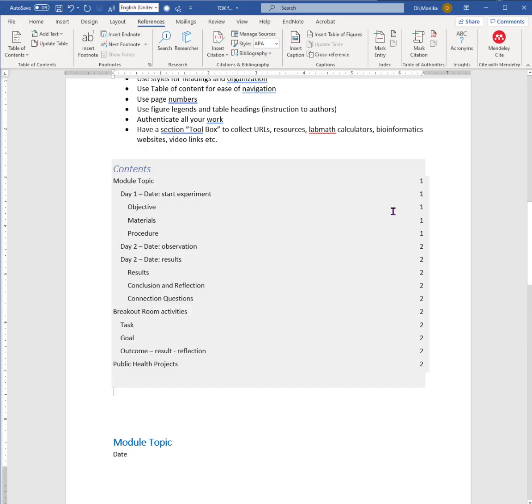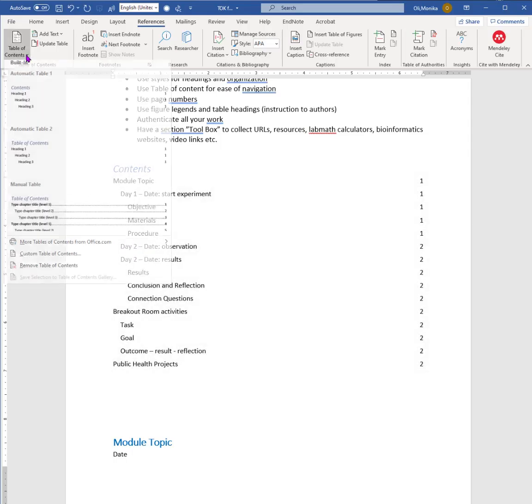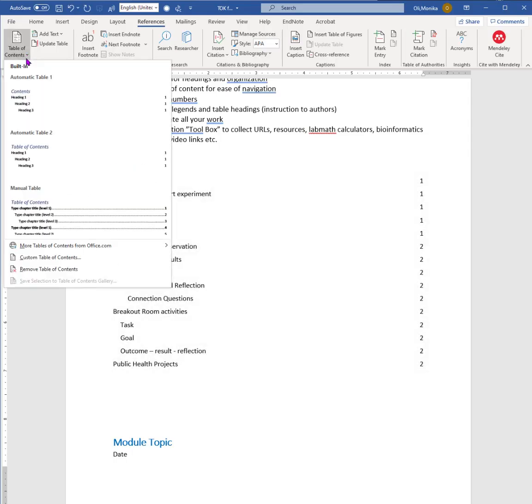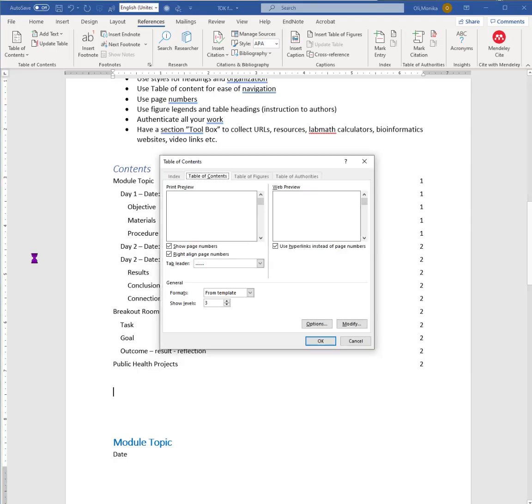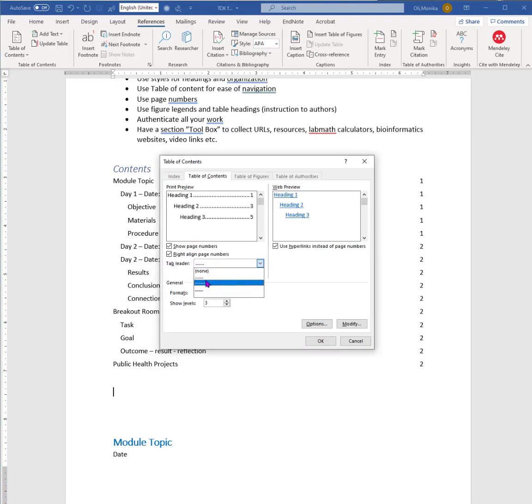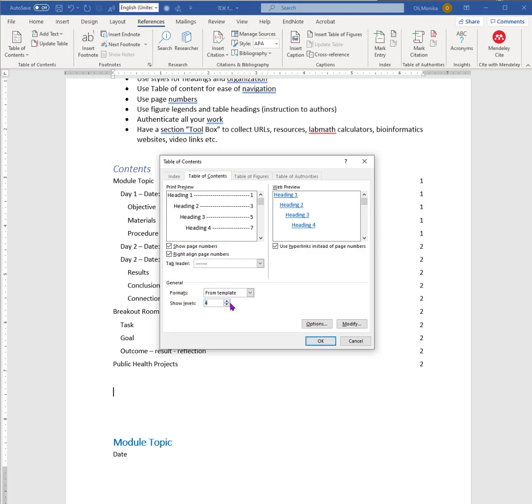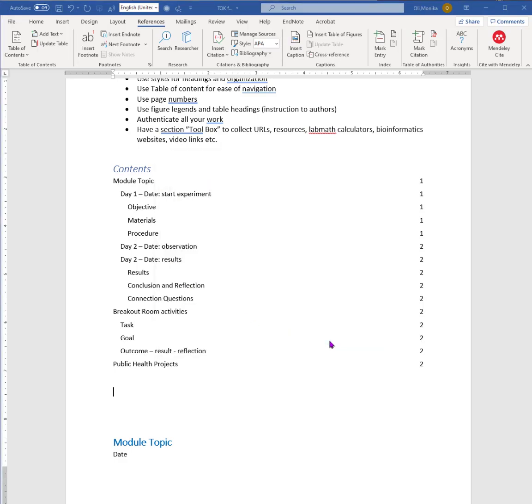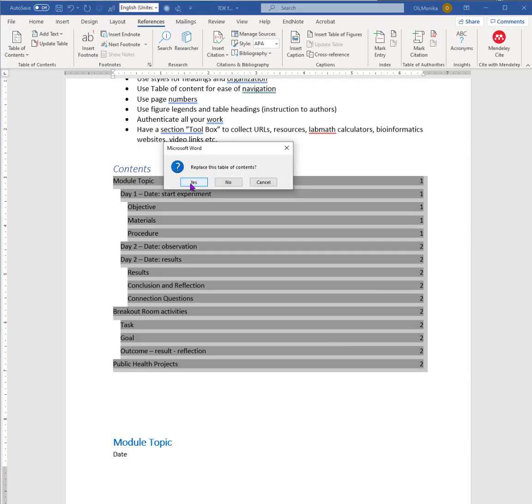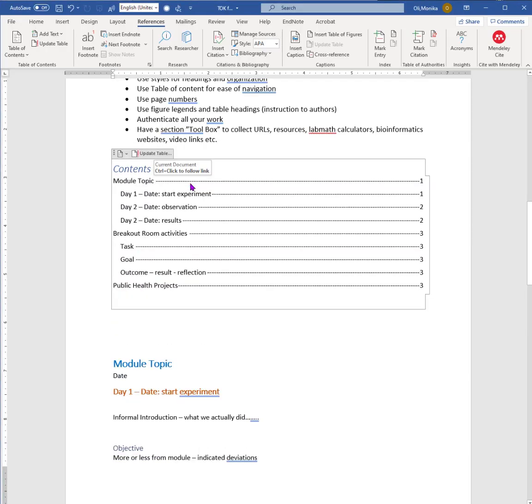If you want to have dots in between, if you want to format it differently, you can say Custom Table of Contents. For example, if you want to have the dots in there, page numbers. If you only want to show two levels for example, that's fine as well, it's up to you. Otherwise it can get pretty long, and then it looks like that. So it's up to you in terms of formatting.